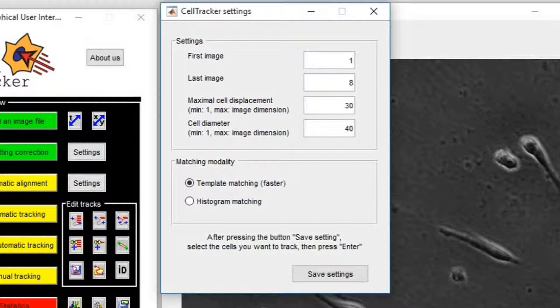In the histogram matching modality, the coordinates of the cells in the next frames will be defined by looking for the best correlation of the histogram. It is a slower matching modality, but it is not dependent on the orientation of the cell during its motion.